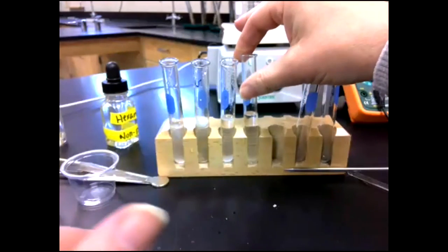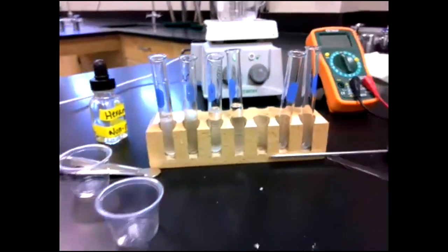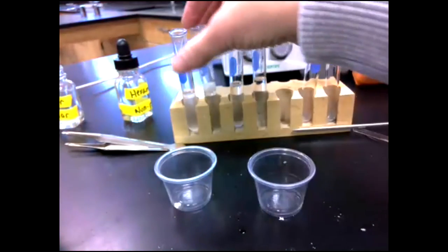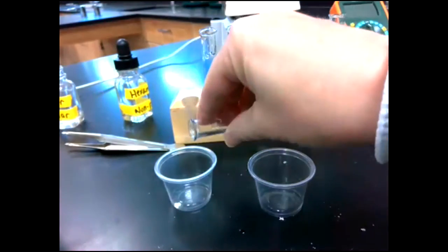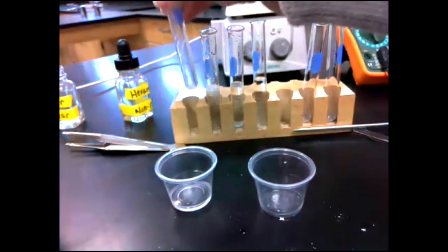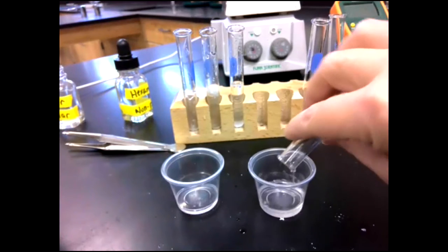So they're going to look alike, but they're not alike. So this is going to be A in water, and this is going to be B in hexane. So I'll dump A in water here, which is why the instructions say don't dump them out, because we're going to use them again. So that's A in water, and this is B in hexane.